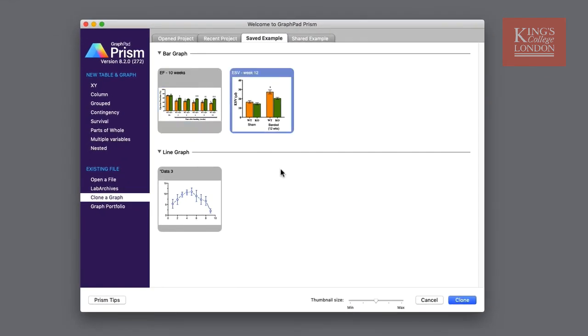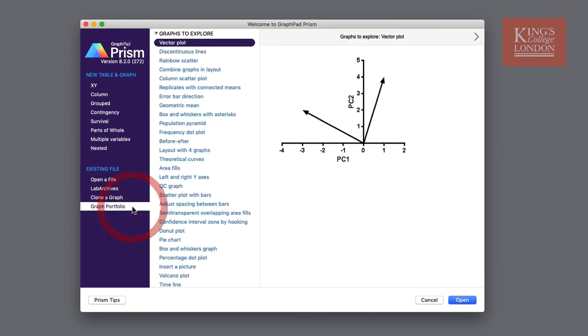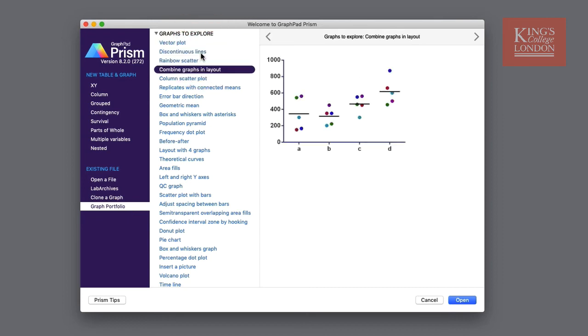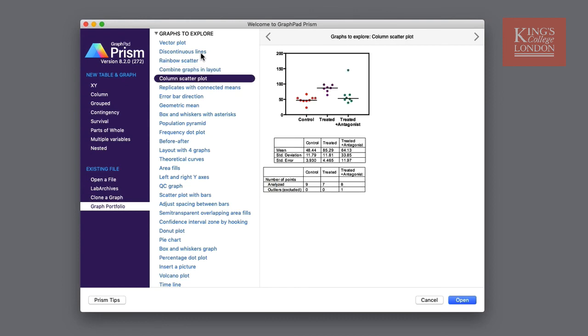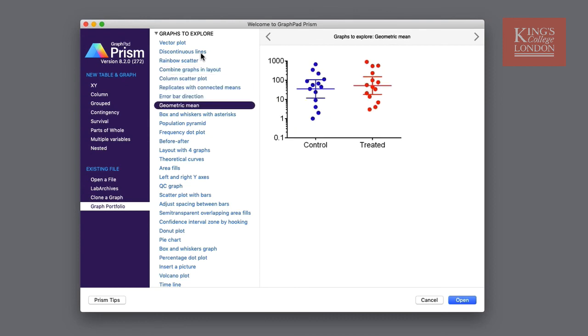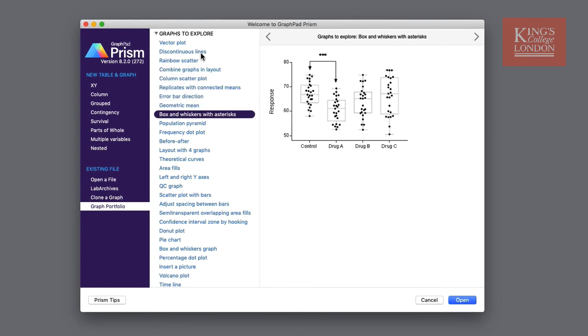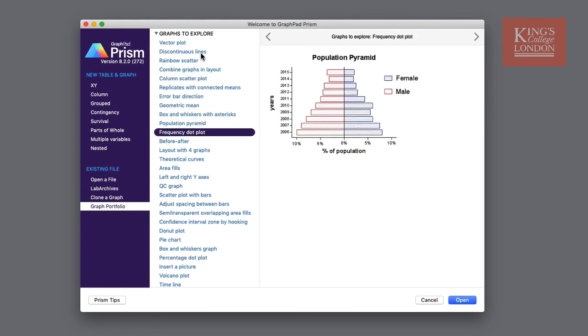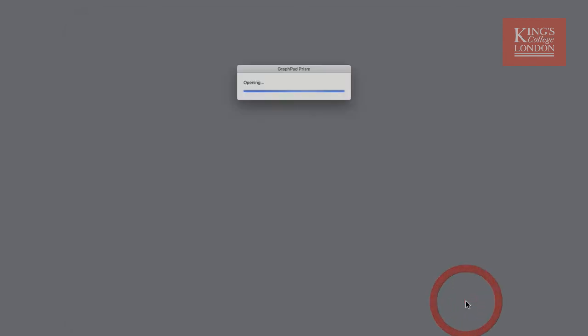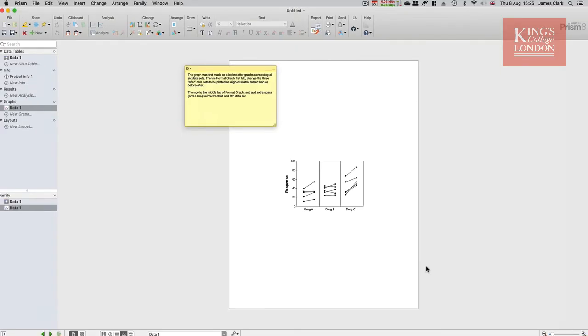A particularly useful feature of Prism is the graph portfolio. By clicking on graph portfolio you'll be presented with a list of graphs that you can explore. You can scroll through this list and investigate all the different possibilities that you can achieve using a Prism file. If you like the look of one of these graphs, for instance this one, you can simply click on open and the file and data set will be loaded into Prism.